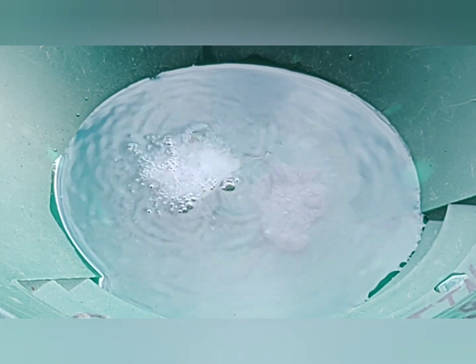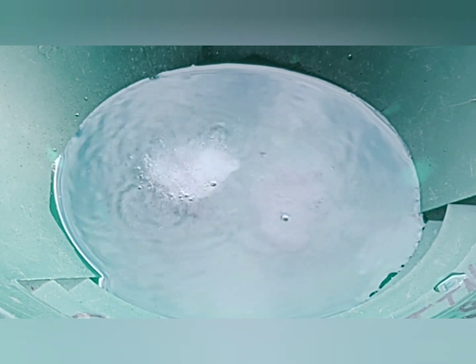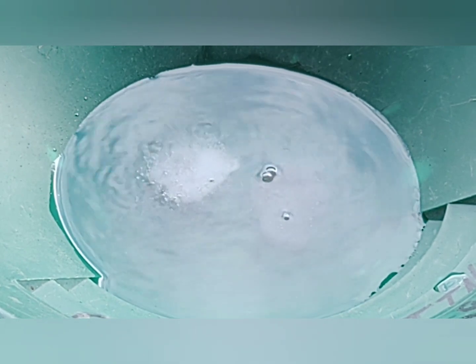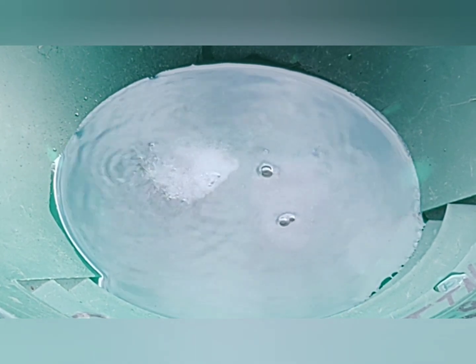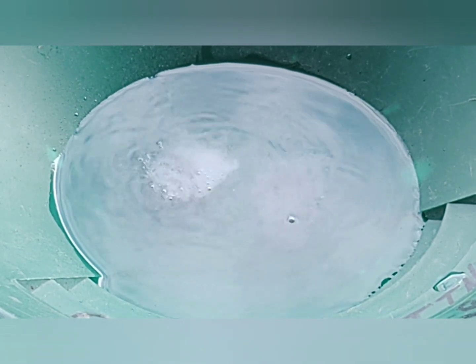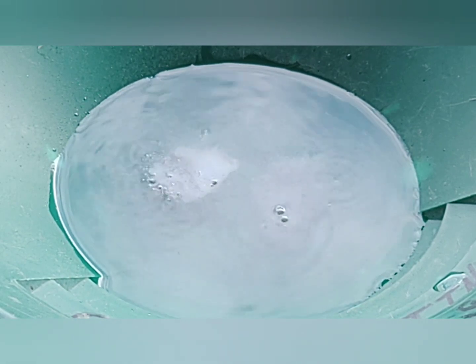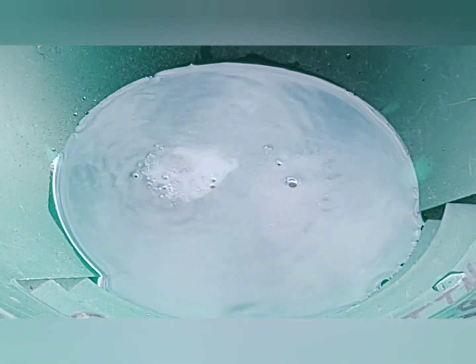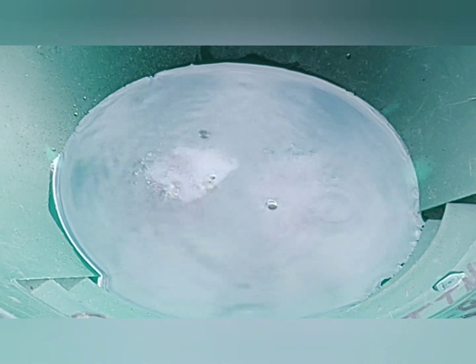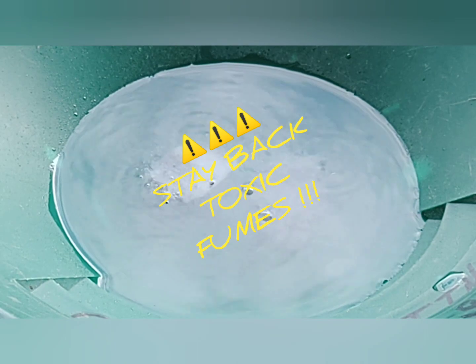Wow, what's going on here? We see the quartz being eaten away. The other one's very slow. I'm going to step back because I do not want to be near that. I'm kind of changing direction. It's 6 o'clock now in the evening, and it will probably take about 12 hours to dissolve all this. I'm going to add just a little more.